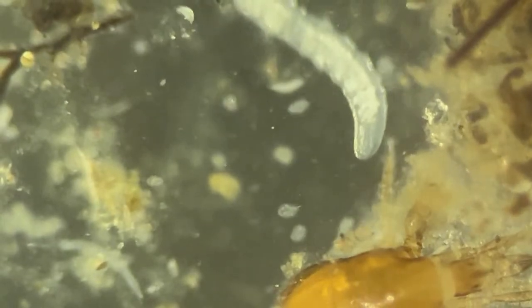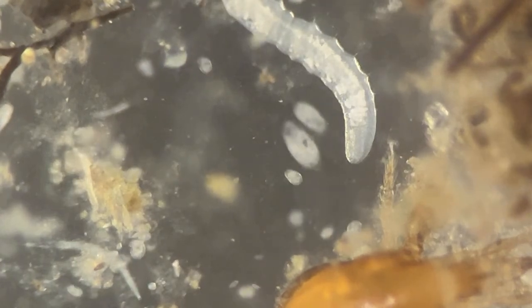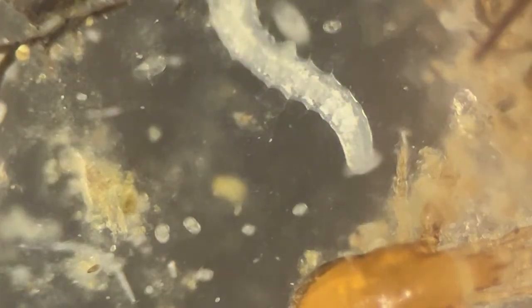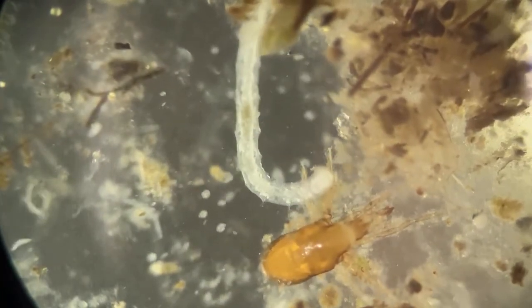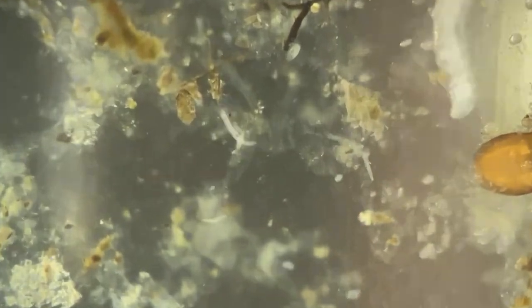Okay, you'll see the eggs. There, you may be able to focus on the eggs now. So this is the benefit of reflected light microscopy. There are some more worms of much miniature size wriggling next to this giant, which is comparatively at least 100 times magnified than the young ones here.